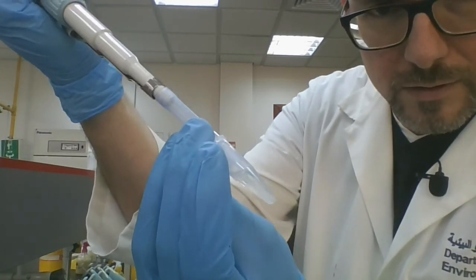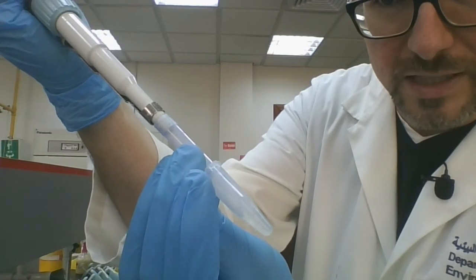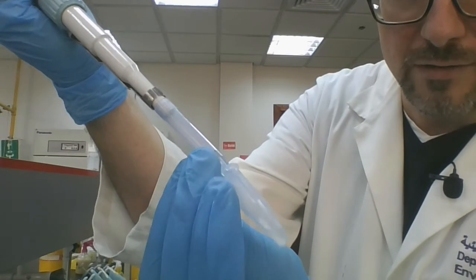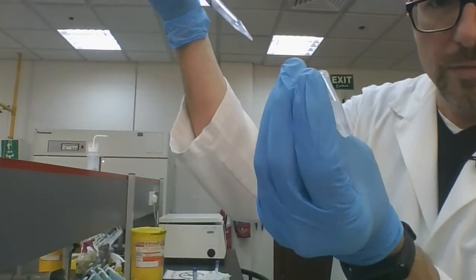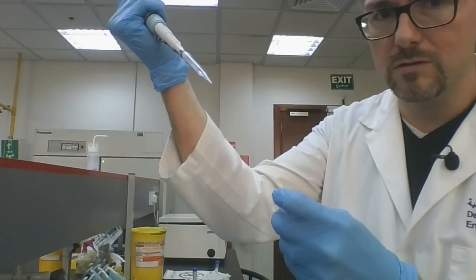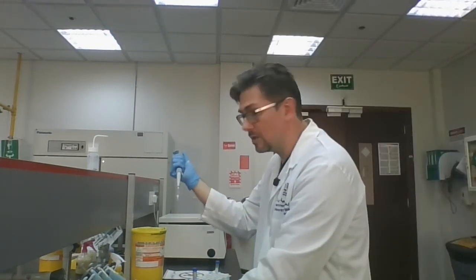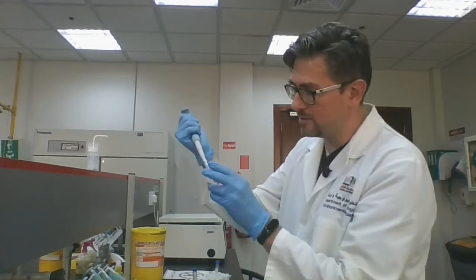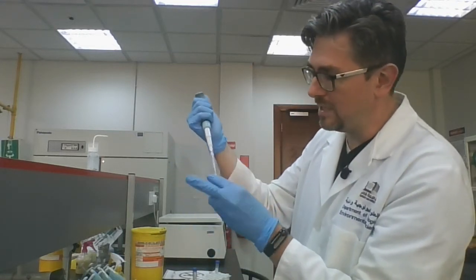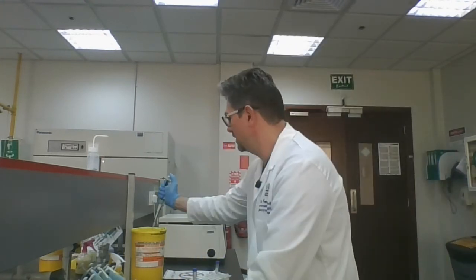sort of. And as I take up the liquid, I'm going to go a little bit deeper with the tip so that I can continue taking out the 400 microliters. So I have 400 in here now. The remainder of this, I'm not going to get greedy. I'm going to leave it behind, okay? So again, the trick is to make sure that you're only taking up what you need, and you don't need all of it. You have more than enough DNA in here, so just collect what you can without contaminating with the pellet. So I have one epitube that's ready to go for the next step.